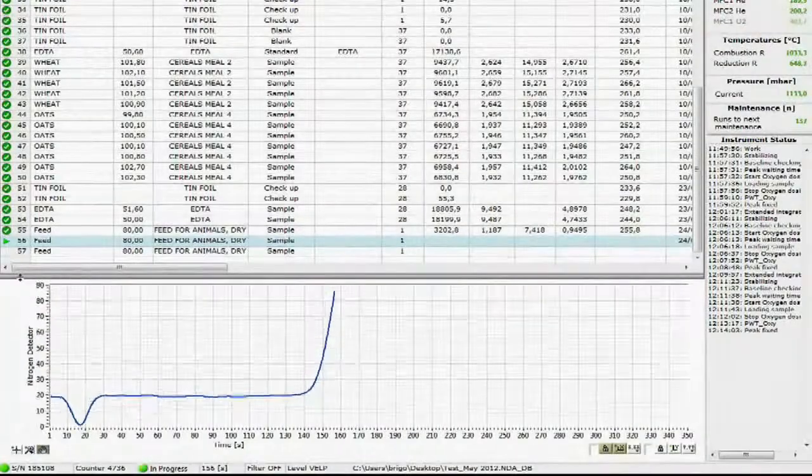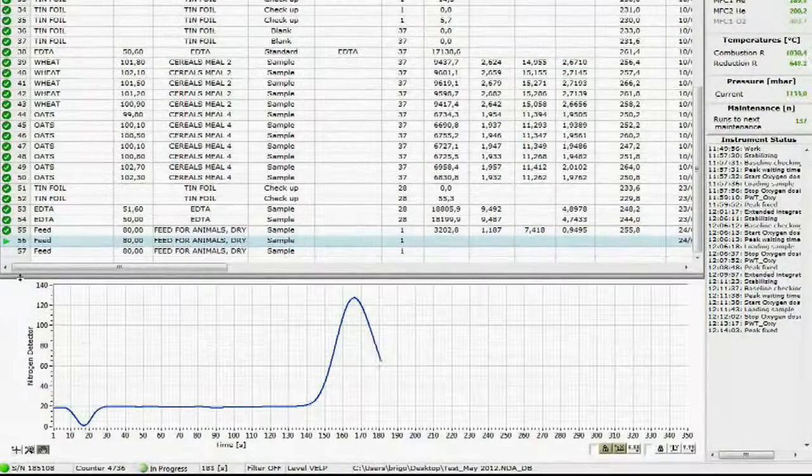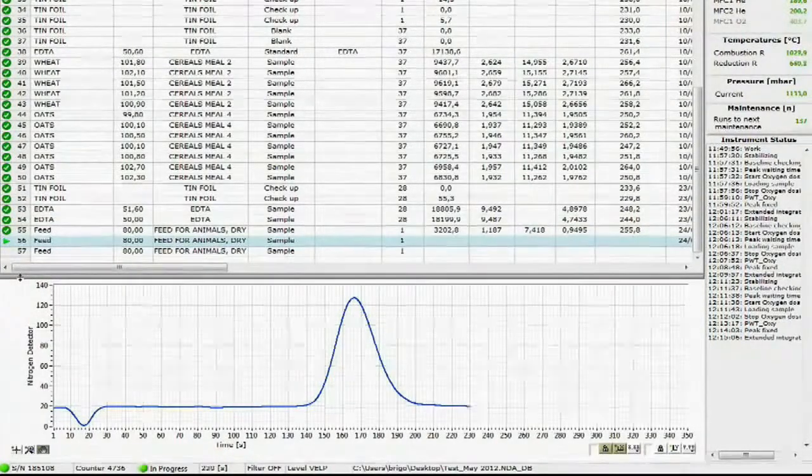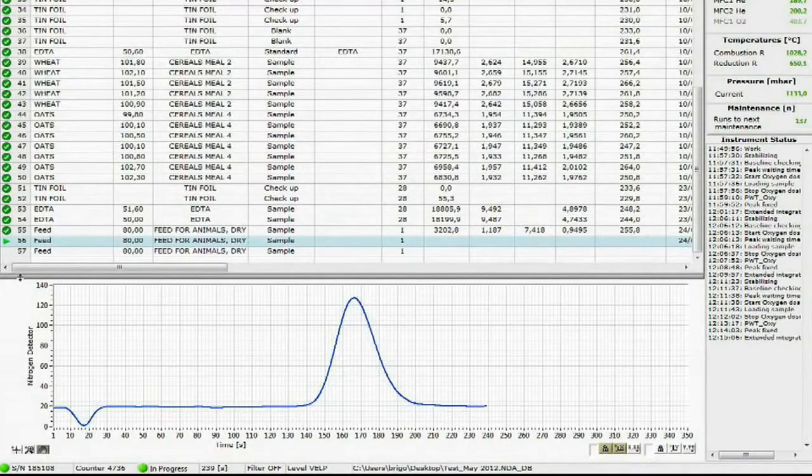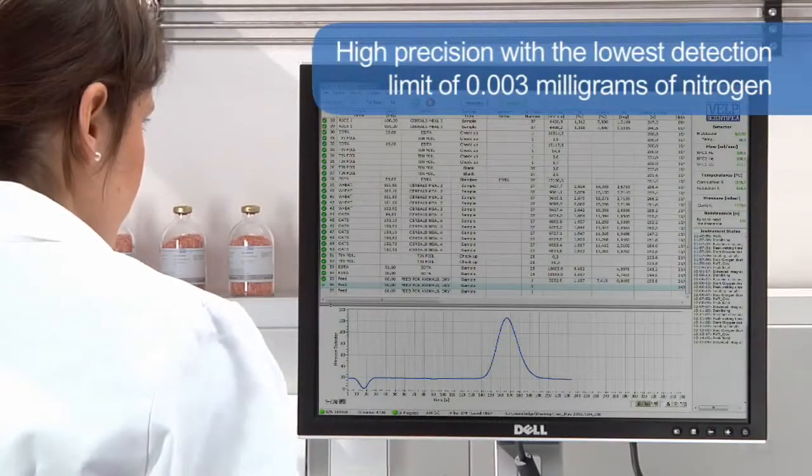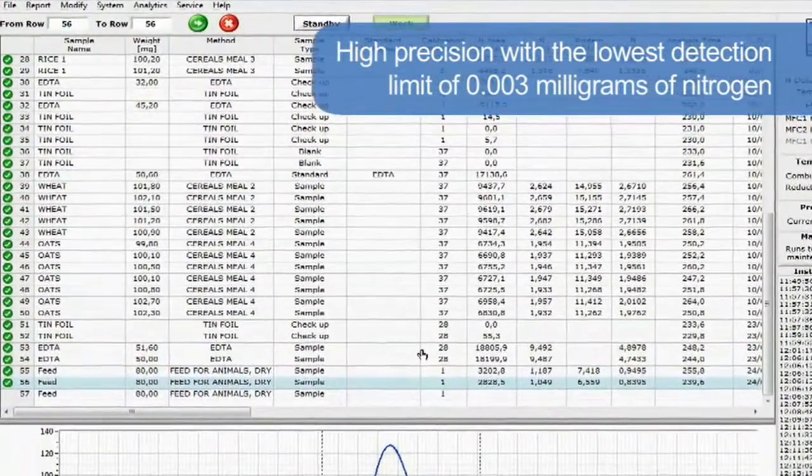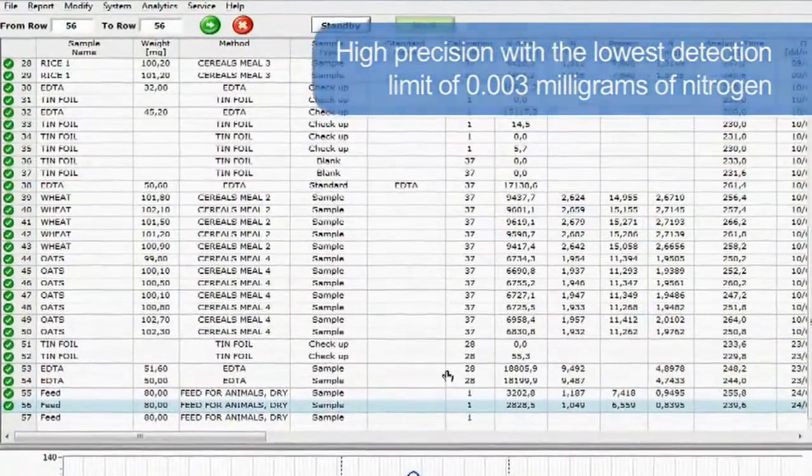The real-time graph shows the progress of the analysis, creating the peak as soon as the nitrogen starts reaching the thermal conductivity detector. The NDA701 provides the highest precision of any such analyzer on the market, with the lowest detection limit of 0.003 mg of nitrogen.